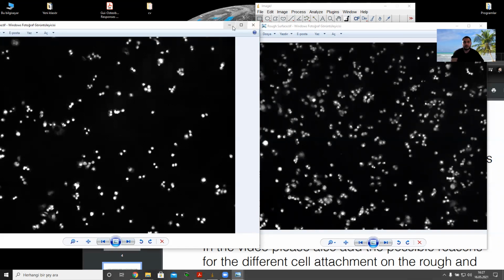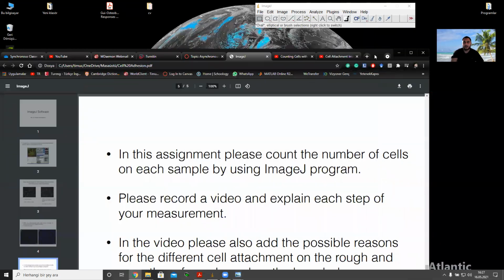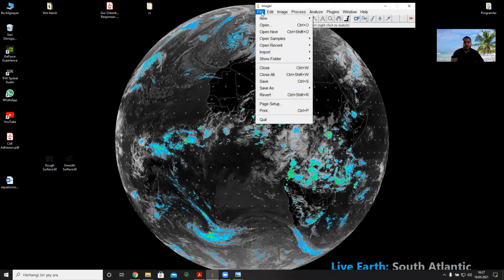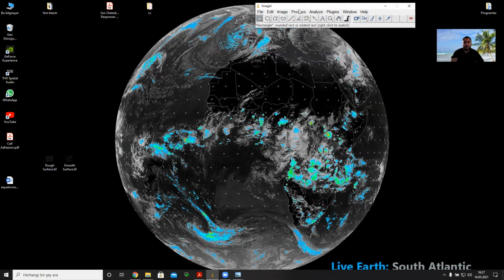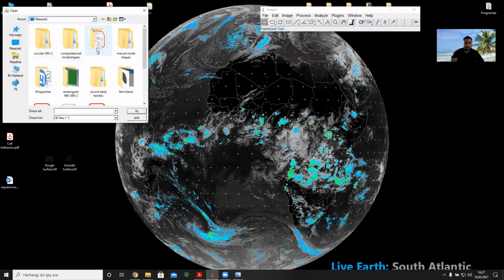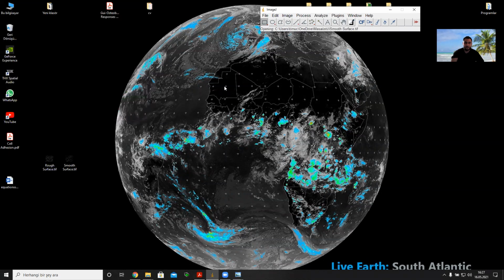And in this video, we are going to analyze and point out the cell numbers. During this analysis, we are going to use the ImageJ program, which is free software. First of all, let me start with the smooth surface.